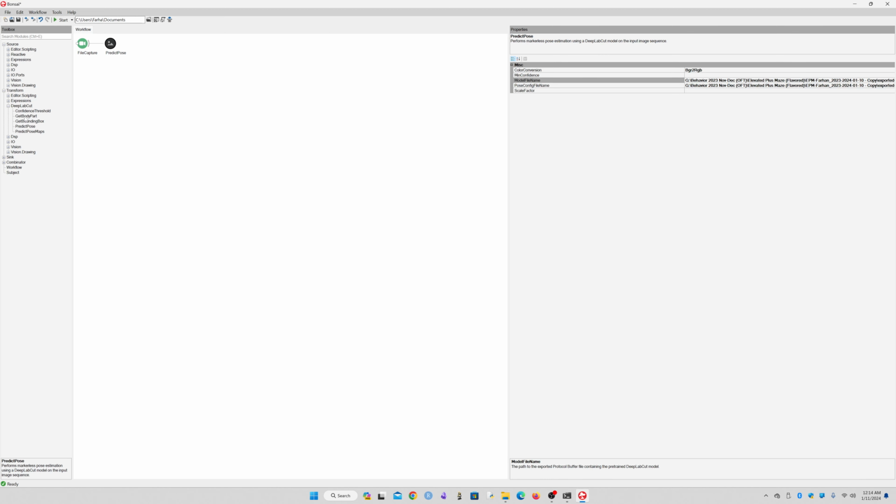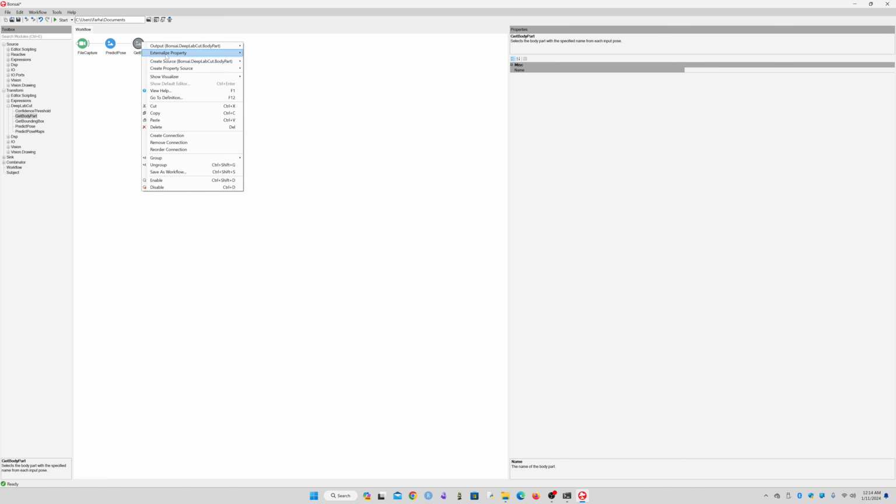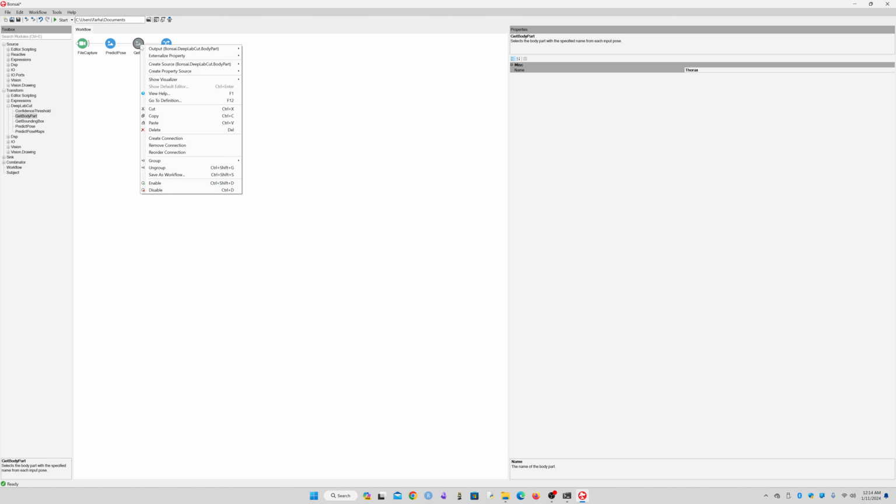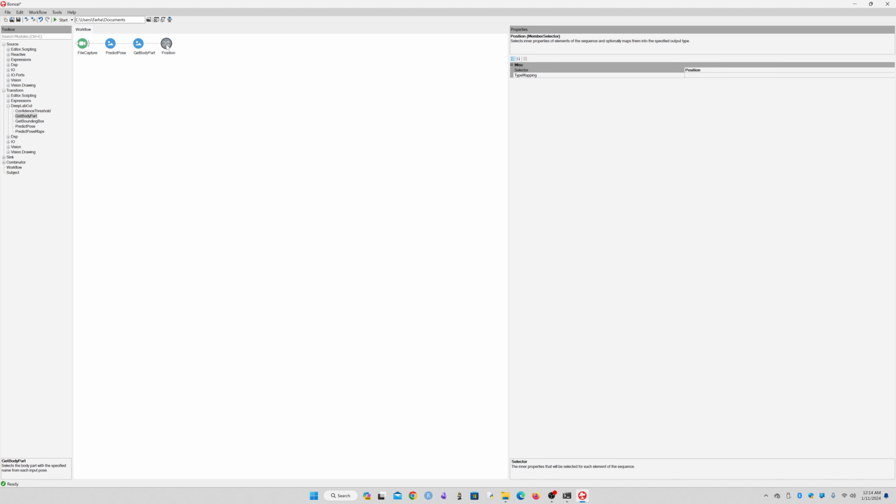I'm going to go ahead and analyze a body part. So to analyze just one body part, I'm going to pick thorax. And then again, I navigated and brought up the position data. You can do that by right clicking, going over to the output, and then clicking on position. It will bring this node up, and this node will contain the X and Y coordinates.